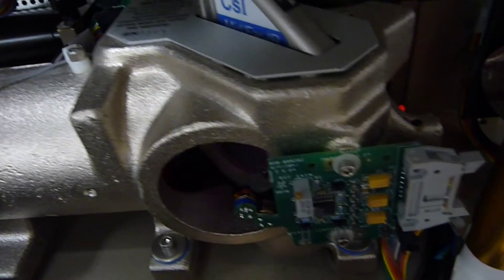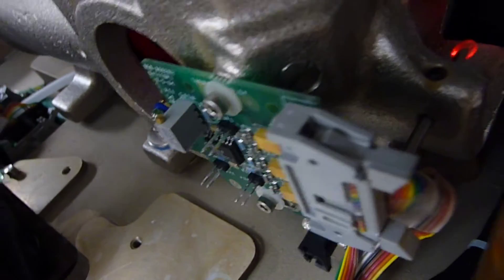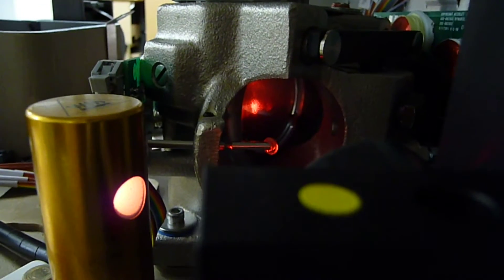That's the actuator for the mirror. And then let's see the other end of the beam splitter. There's the other end of the beam splitter, and then there's the laser detector. And then the source.